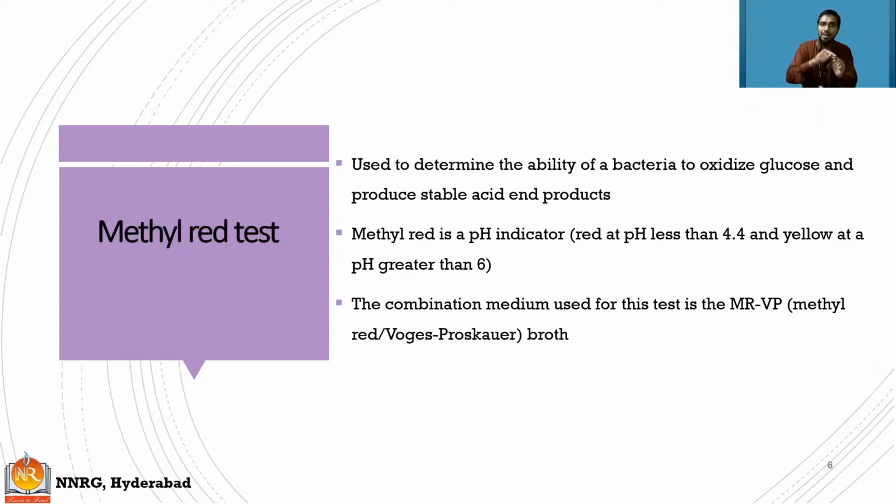So from aldehyde to carboxylic group, it is forming. What is it forming? From aldehyde, C double bond OH, to COOH. It will be a carboxylic group. So from aldehyde, it is forming an acid, right? So there will be a change in pH because of that.